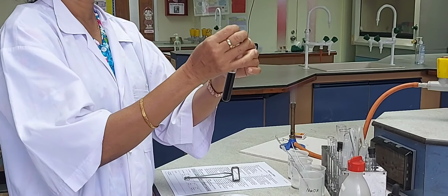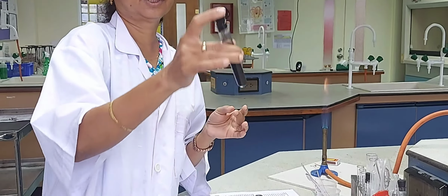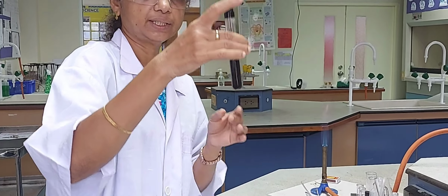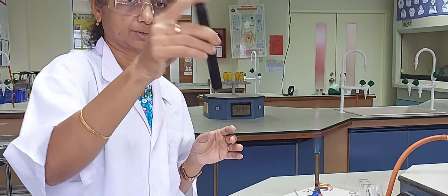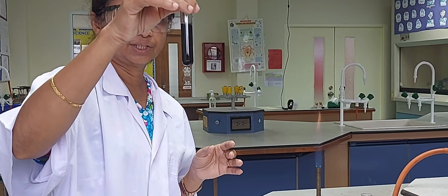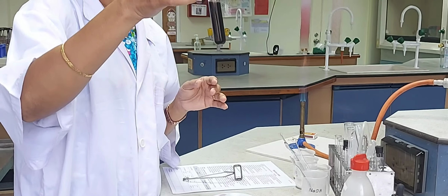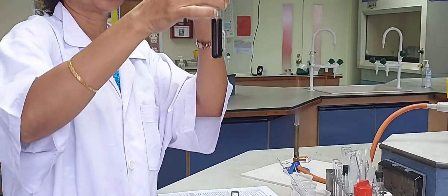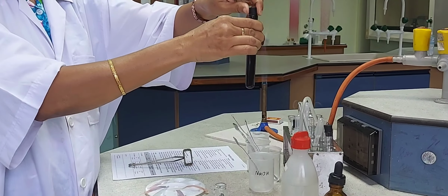Even on shaking, you get a black solution there, but it's actually not exactly dissolved. Okay, copper oxide is not soluble in water. It just mixes because it's a fine powder, and you get a black solution there. And if you leave this for some time, the copper oxide particles will settle down. So that's what I will leave it, and you can see that it is already settling slowly.